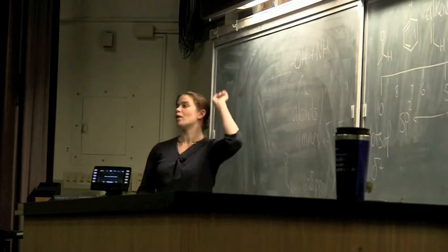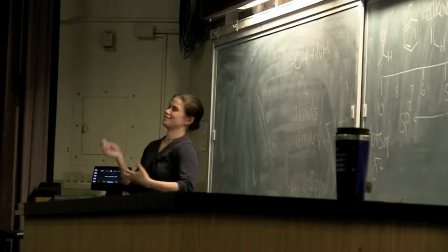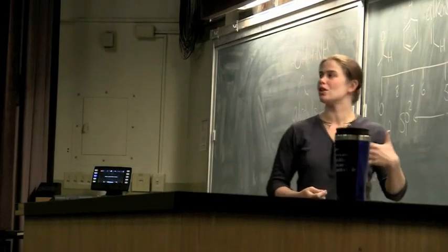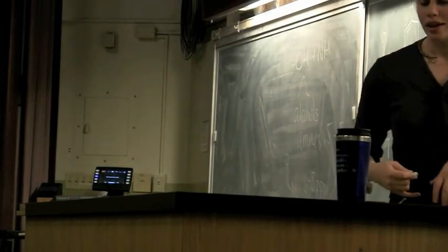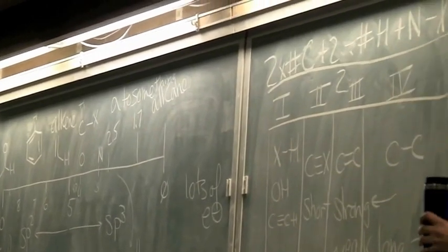Carboxylic acids tend to show up way downfield. Things that are sp2 tend to show up in the sp2 region. They still vary a lot because of hydrogen bonding, but they tend to show up in the sp2 region as opposed to the sp3 region. It helps keep track of what's going on with them, because those guys are squirrely, they just run around. You can't necessarily tell where they're going to be today.